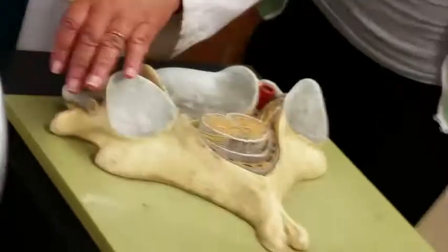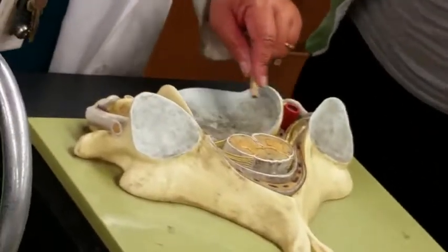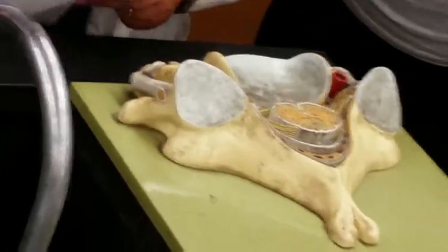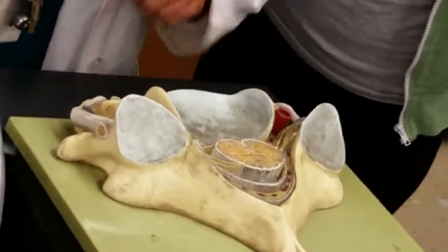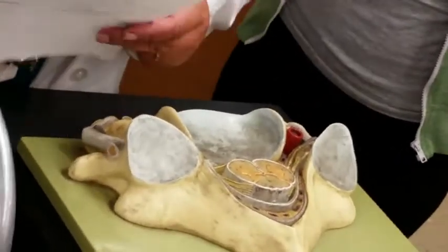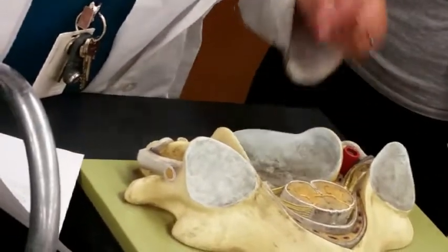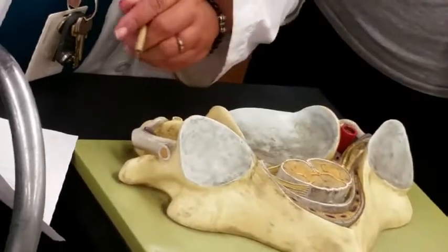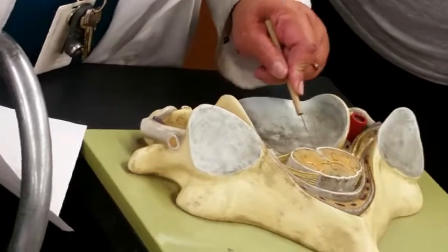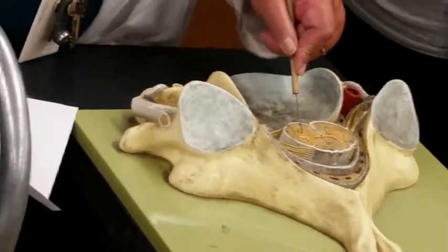So this is one of your bones in the backbone. And here is the spinal cord that goes through that cavity. So this is a cross section of the spinal cord, and here's the bone around it. Usually for the brain, the gray matter is on the outside and the white matter is interior. It's opposite in the spinal cord. The butterfly wings represent the gray matter. So gray matter, gray matter.